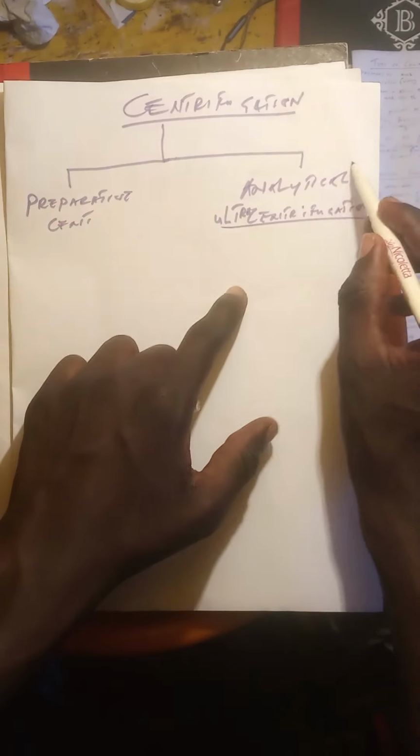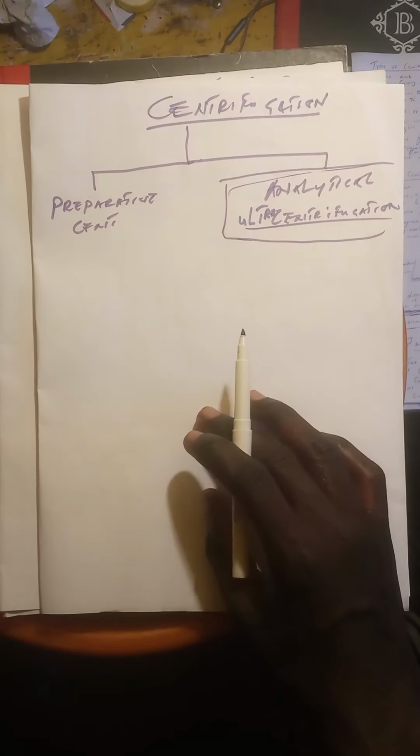And mostly analytical centrifugation is referred to as analytical ultracentrifugation. Why? Because mostly the types of centrifuges used in analytical centrifugation are ultracentrifuges. So we can come to preparative centrifugation.